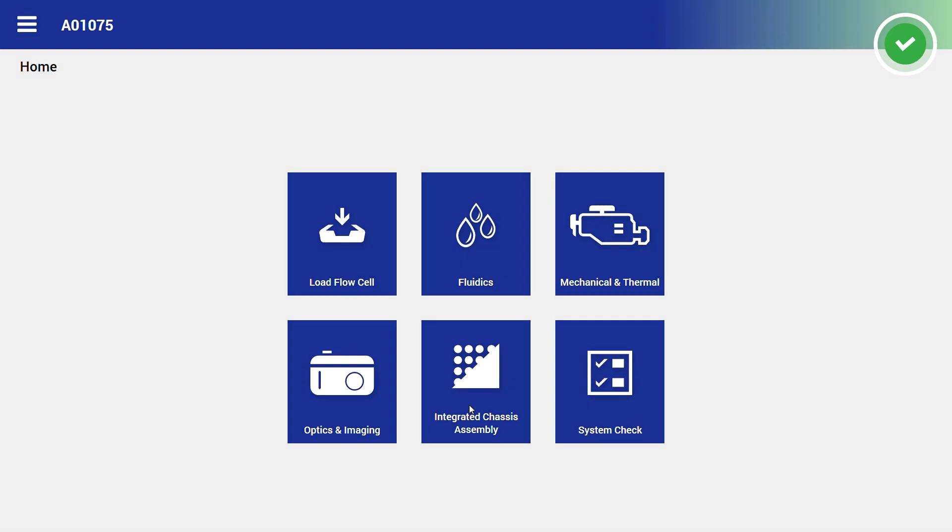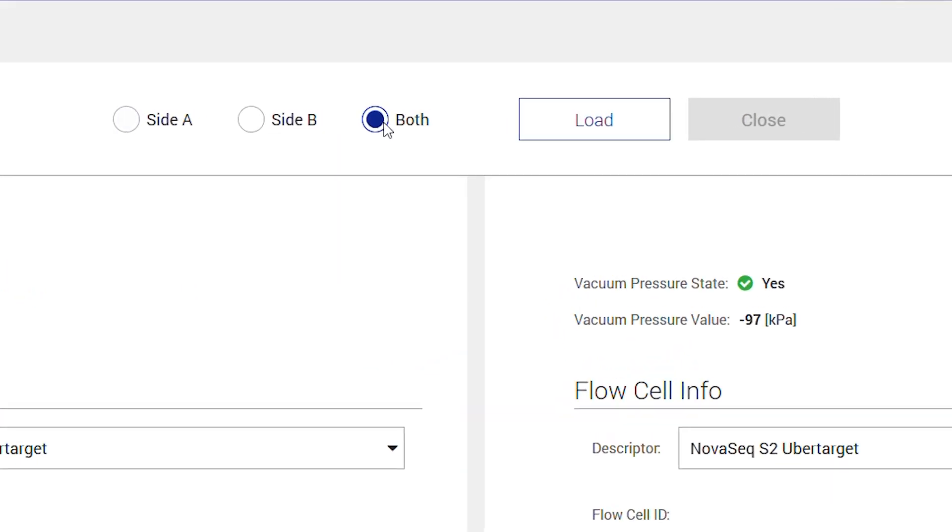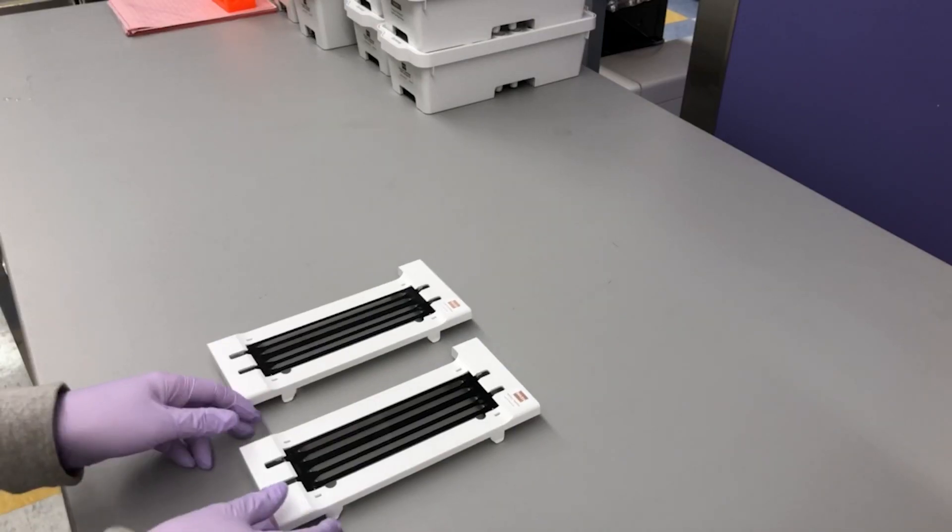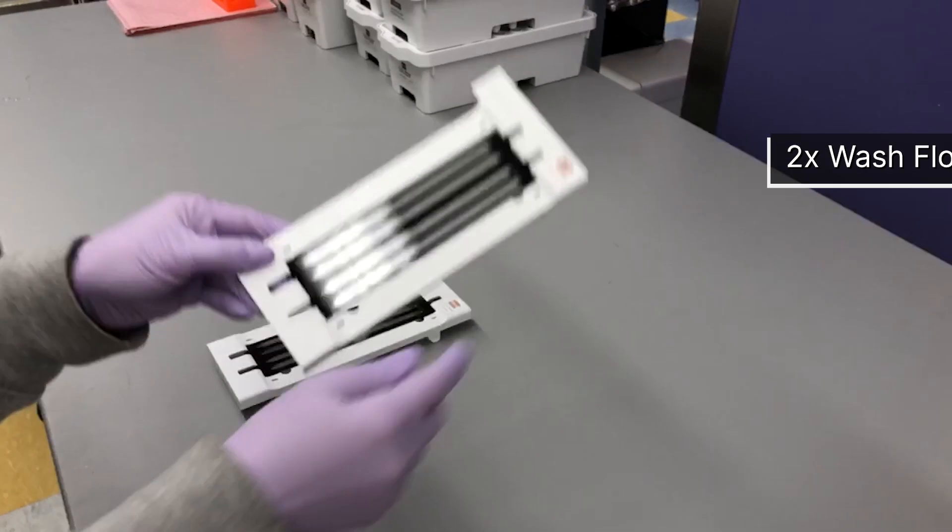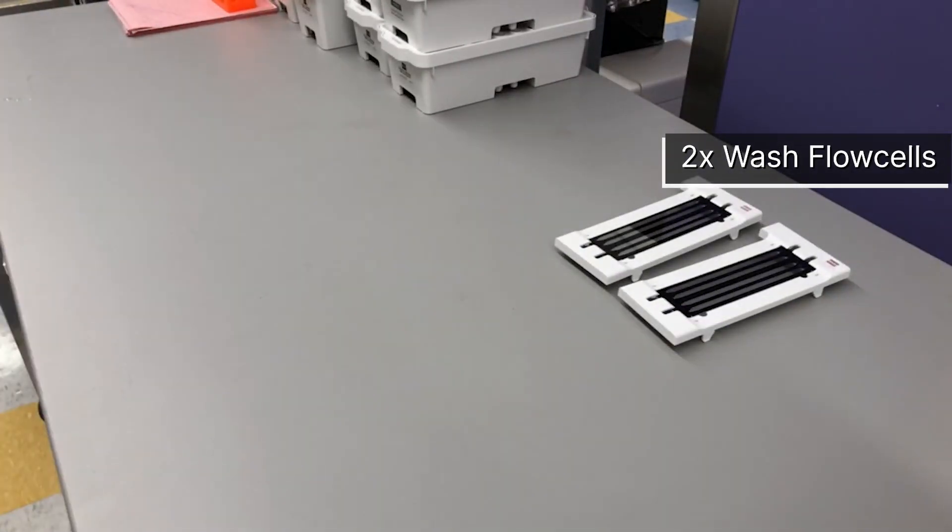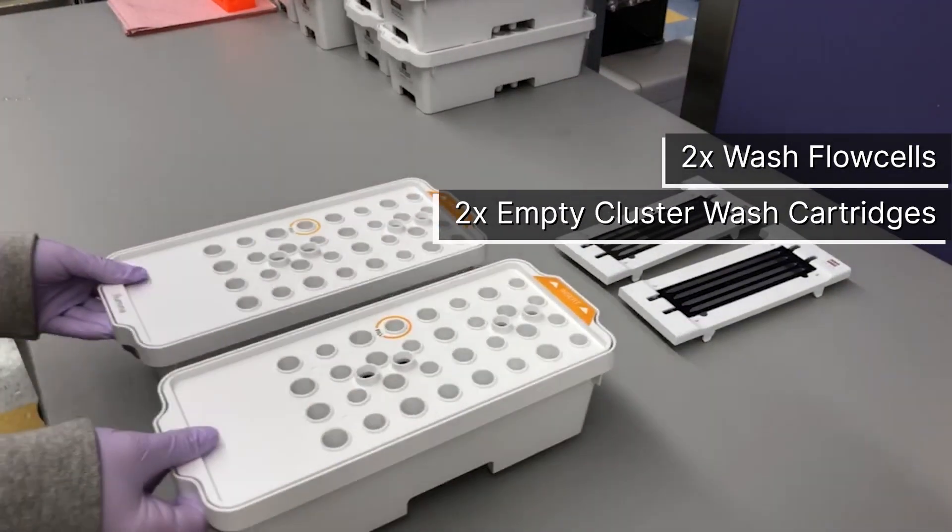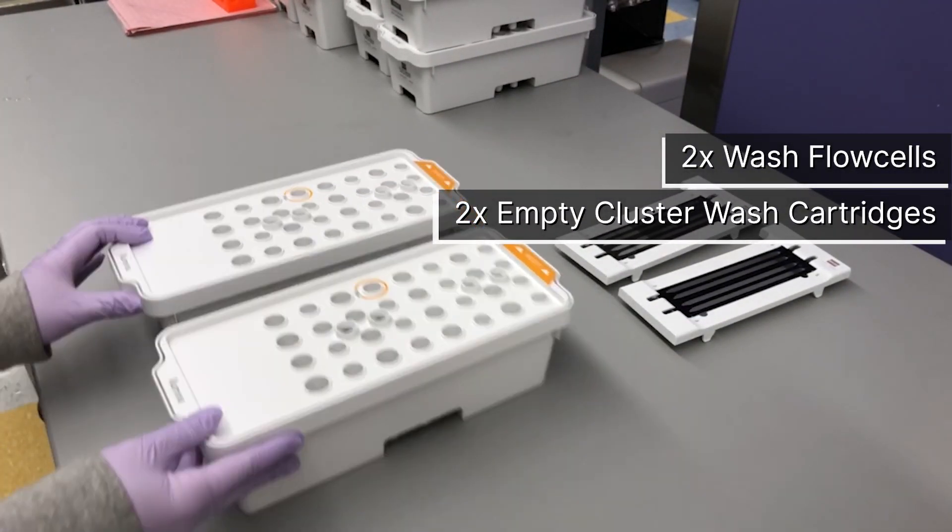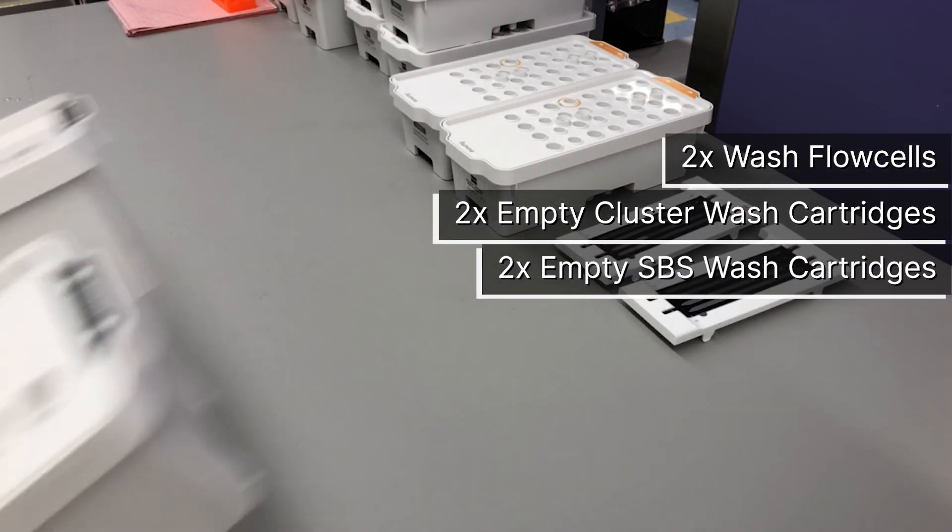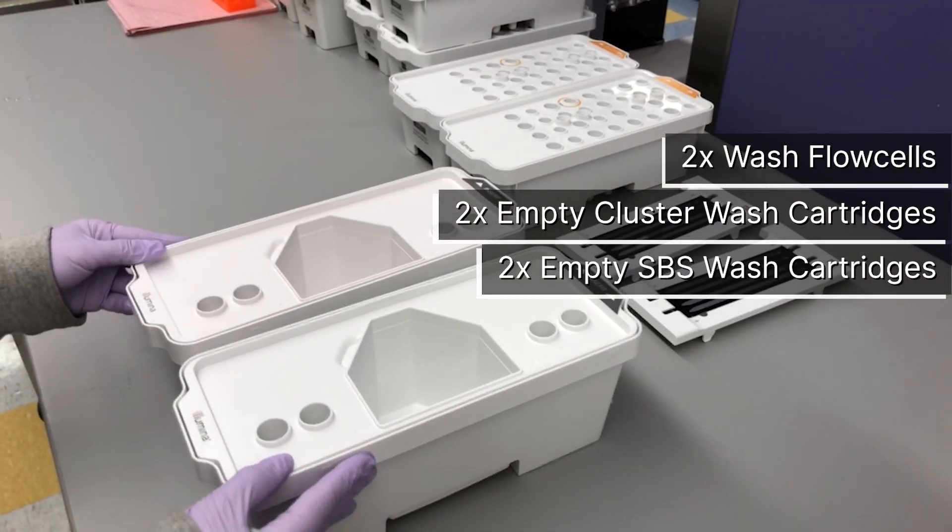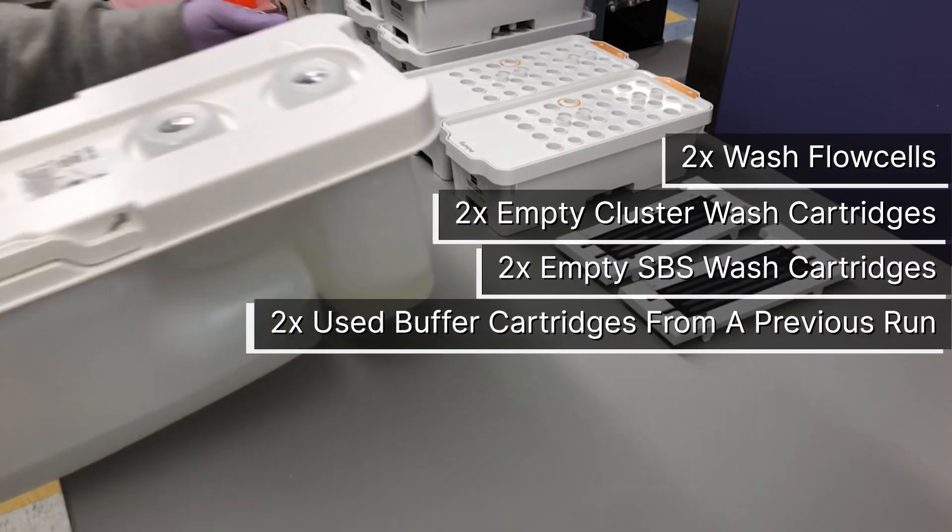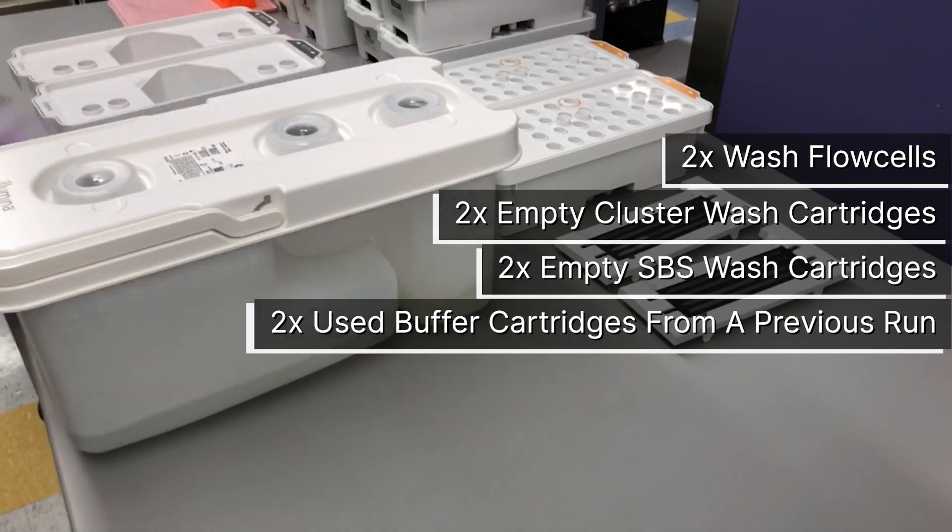To perform the system check on both sides, you will need two wash flow cells, two empty cluster wash cartridges, two empty SPS wash cartridges, and two used buffer cartridges from previous runs.